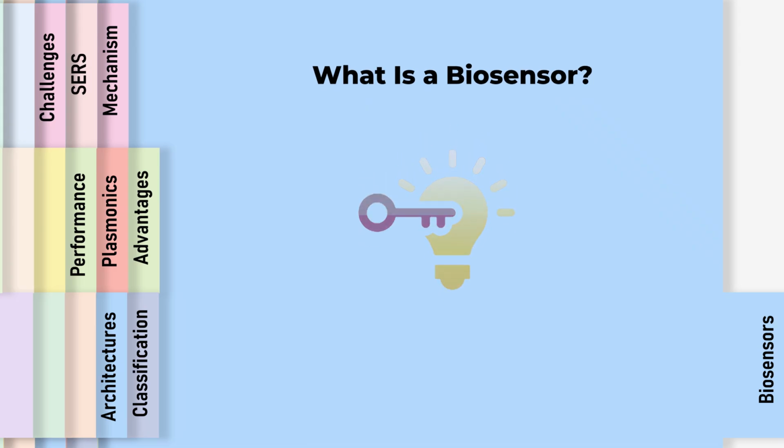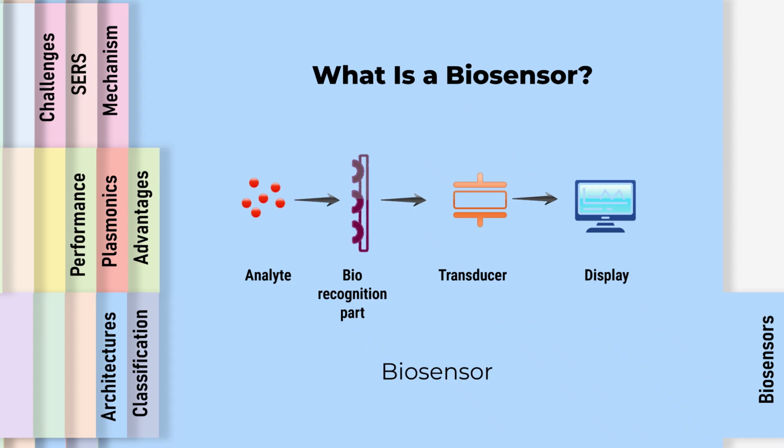A biosensor is a self-contained device that uses a biological recognition element in direct contact with a transducer to provide specific qualitative or semi-quantitative analytical information. In simple terms, it combines biology and electronics to detect something and convert that detection into a measurable signal.